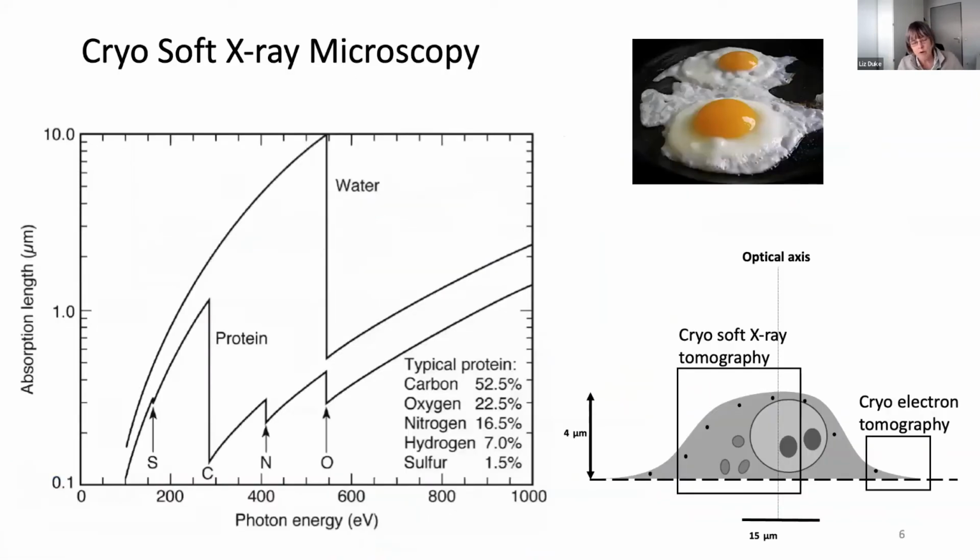So what is cryo-soft X-ray microscopy? We use the term soft to distinguish these X-rays. They're very low energy X-rays.